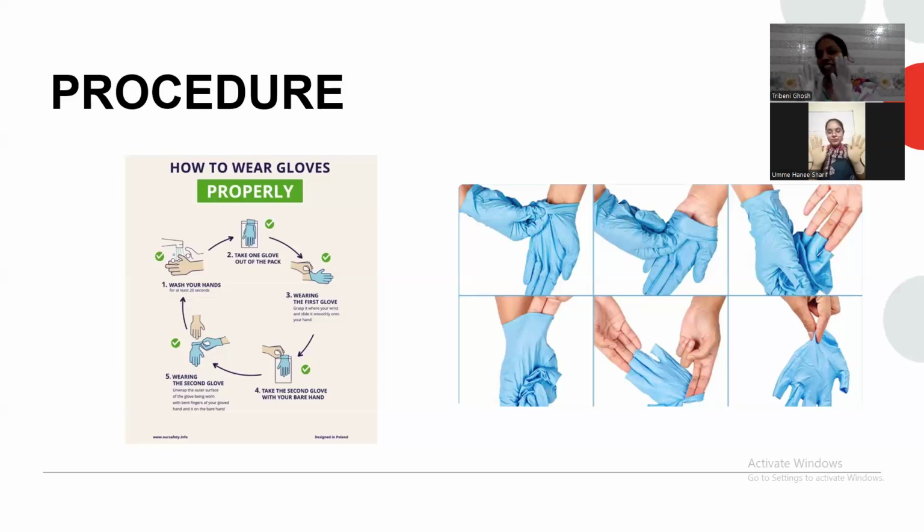The tricky part is taking off your gloves, doffing. After you have done your experiment, the upper part of your gloves is contaminated. You don't know what it contains. It may be harmful for you, so you cannot touch your bare skin with these gloves, or any lab equipment with these gloves. What you have to do is pinch a little, like the video shows.